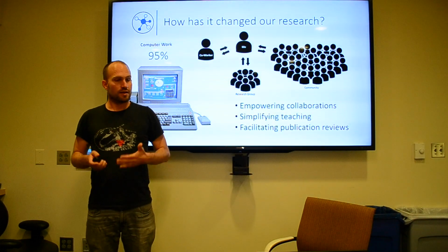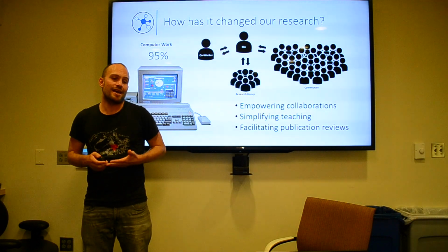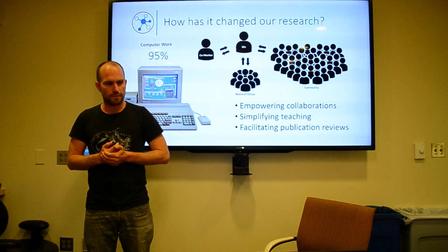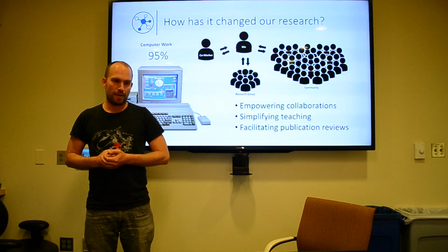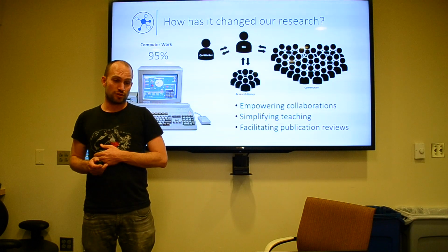Taken together, this really empowers our collaborations. It simplifies teaching. I have not used it so much myself, other than for some workshops we did, but our coworkers that actually use it in the classroom are super excited about how easy it is to showcase mass spec data analysis to their students.